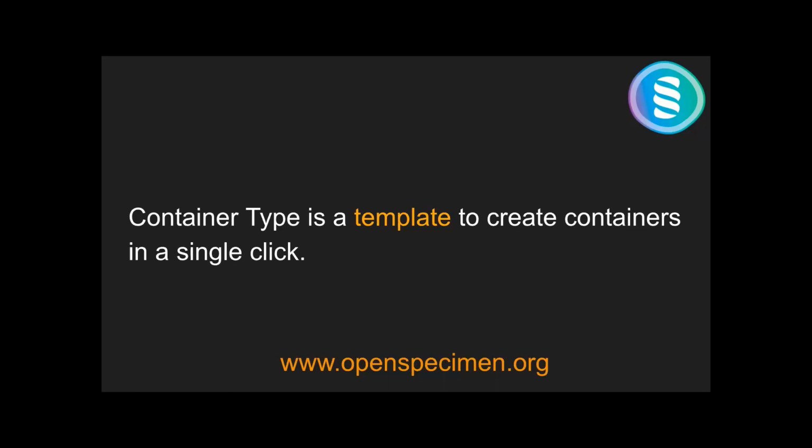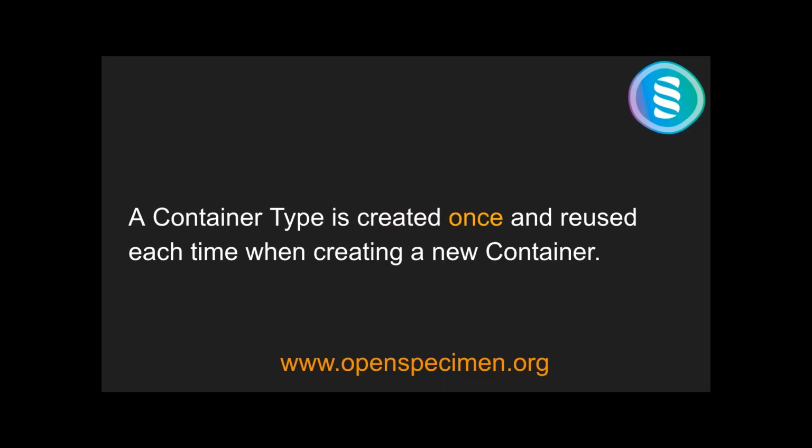Suppose in your day-to-day activities, you keep adding a few boxes, say a 9 by 9 box, every other day. You can create a container type with the label of box 9 by 9, and with a single click you can keep adding as many 9 by 9 type boxes as you want. This is how the container type is used.